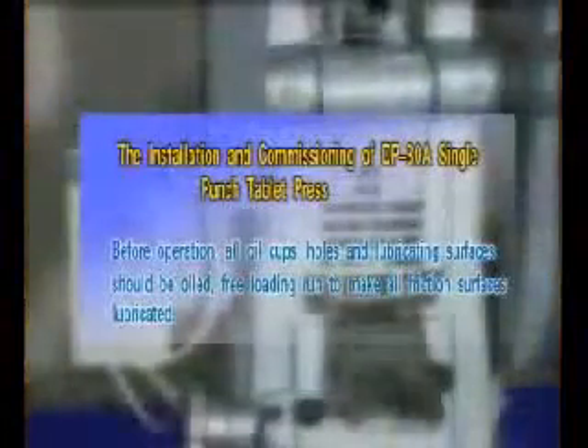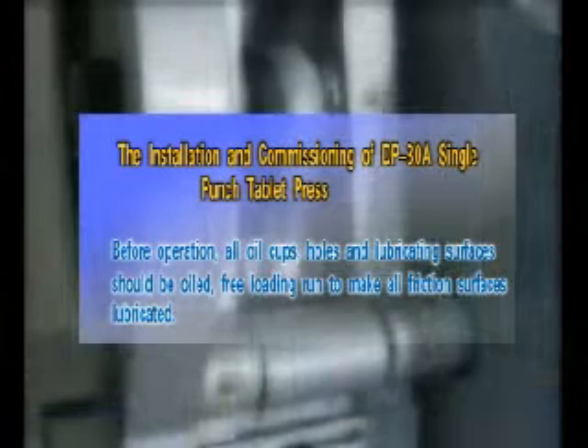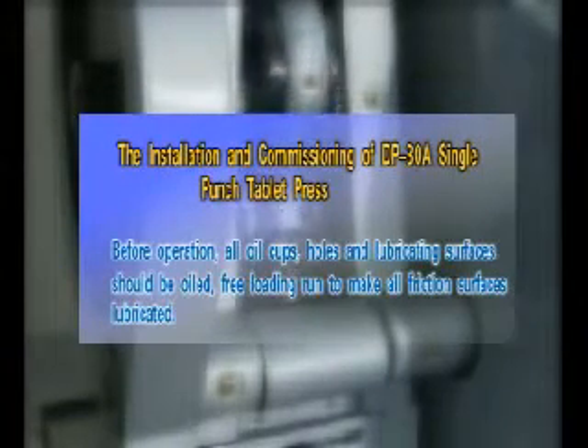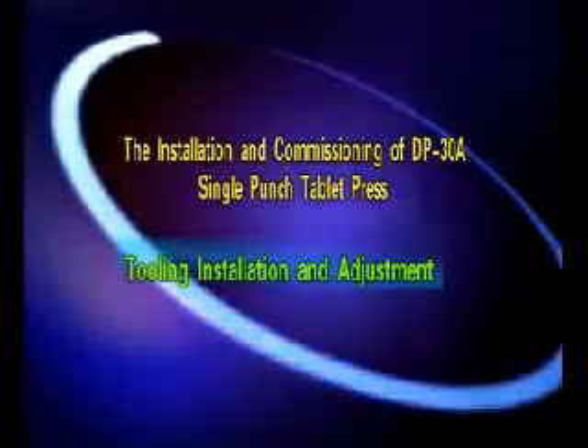Installation and commissioning of the DP30A Single Punch Tablet Press. Before operation, all oil cups, holes, and lubricating surfaces should be oiled. Run the machine under free load to ensure all friction surfaces are lubricated. Then proceed to tooling installation and adjustment.